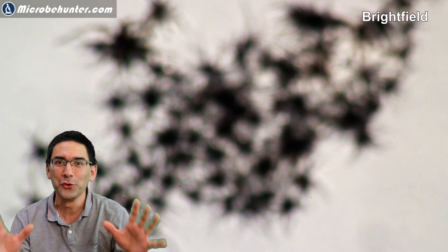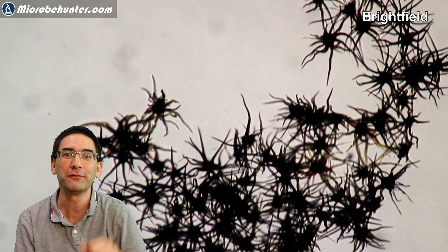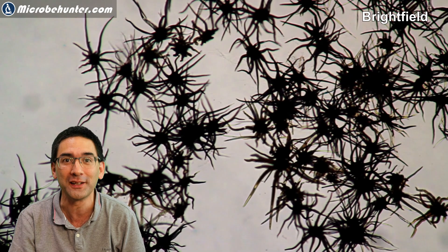Those things you see here in the back — these are not spiders. These are so-called trichomes, and trichomes are little microscopic hairs that you can find on plants. They are outgrowths of the leaves and of other plant surfaces.